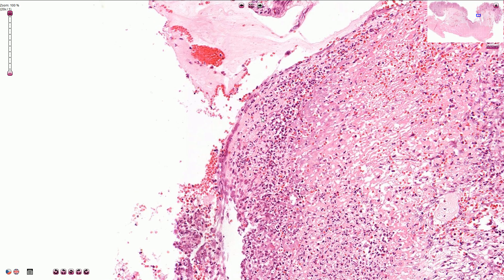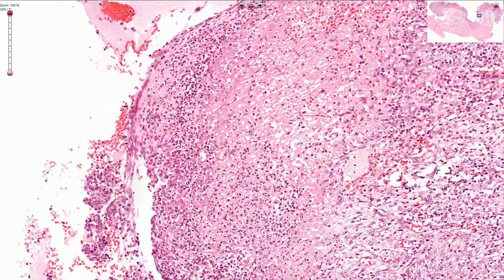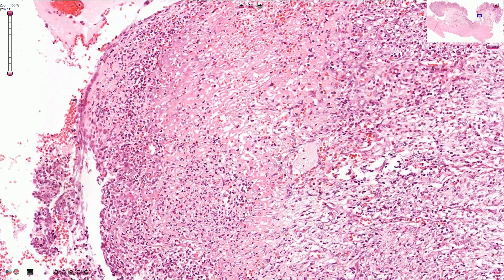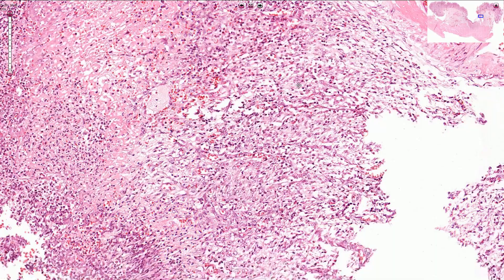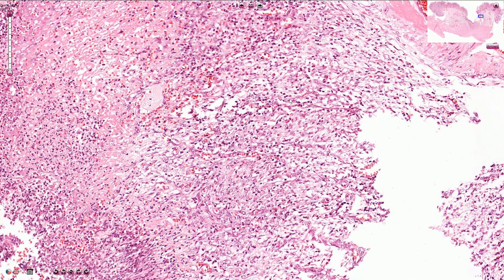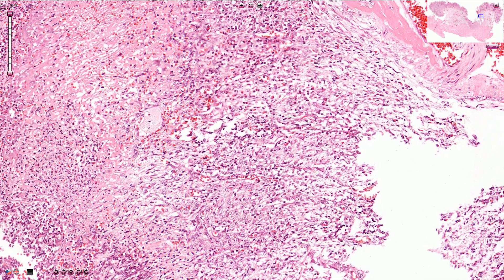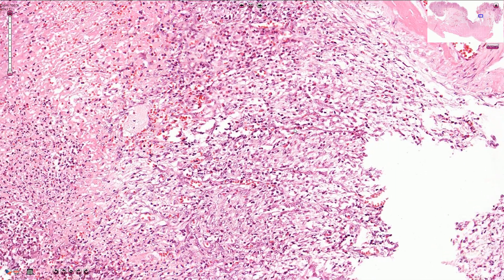Some of them are karyorrhectic. Going deeper, we find the layer of granulation tissue, which consists of small capillaries, many fibroblasts, and collagen fibers. Here we also find inflammatory cells, mostly lymphocytes and eosinophils, though some neutrophils are present as well.